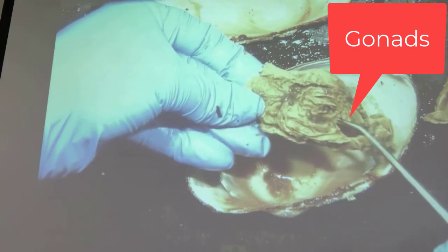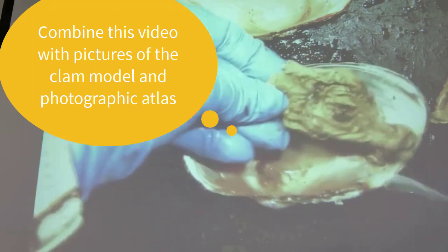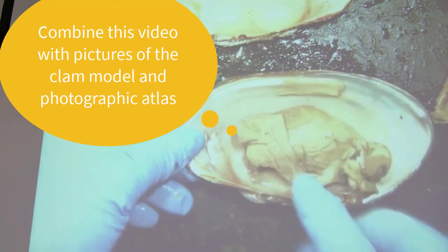Also, this textured area right here is gonads, and that's what we're going to see with the clam.